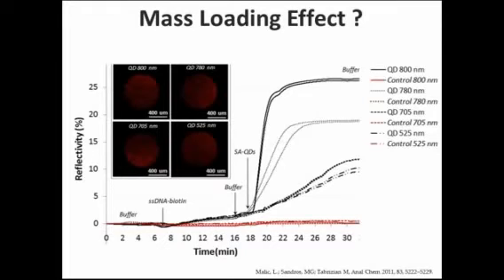And after looking through the literature, there were reports that the interaction of quantum dots and propagating surface plasmons generated from a silver nanowire were bidirectional. So what they explained is that propagating surface plasmons were able to excite excitons, which resulted in the quantum dot emission, and by direct excitation of quantum dots, the exciton decay got converted to propagating surface plasmons. This translates to a coupling phenomenon that is occurring between quantum dots and the propagating surface plasmons.